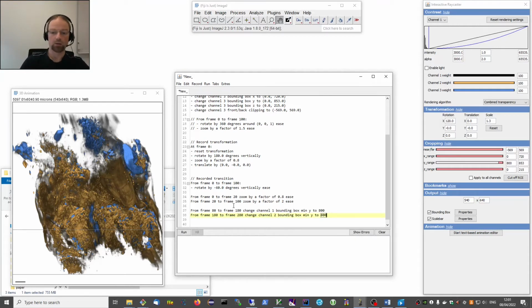And now I would like to get a preview, but I don't want to always render the whole video because that gets time consuming. So I would only like to run the second part.